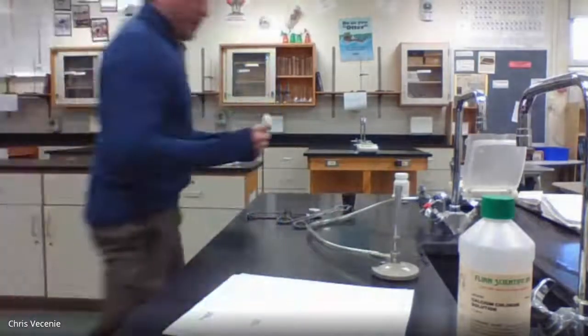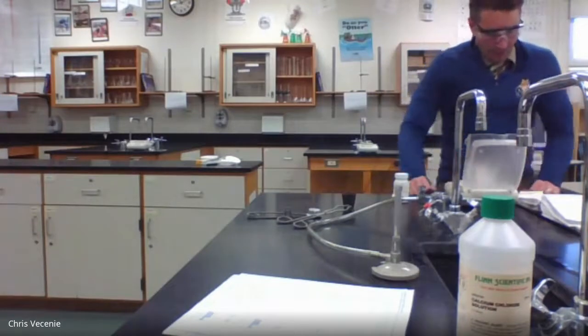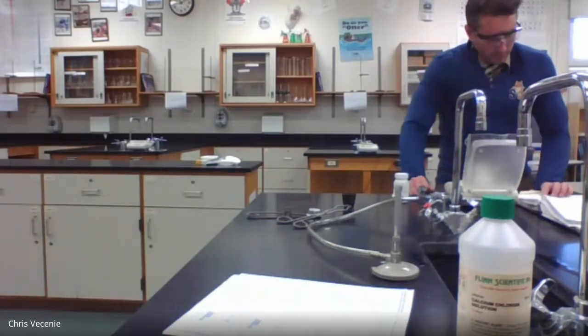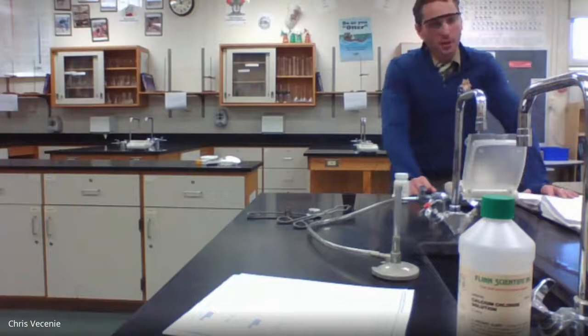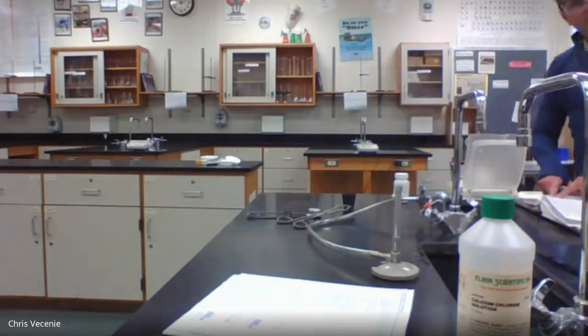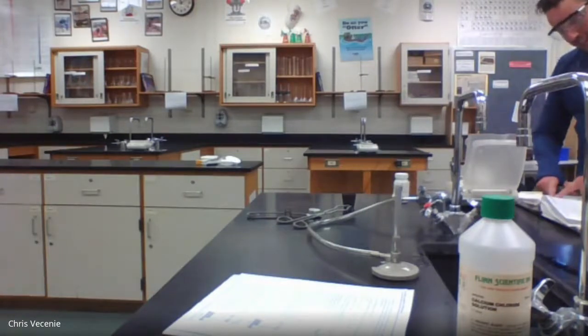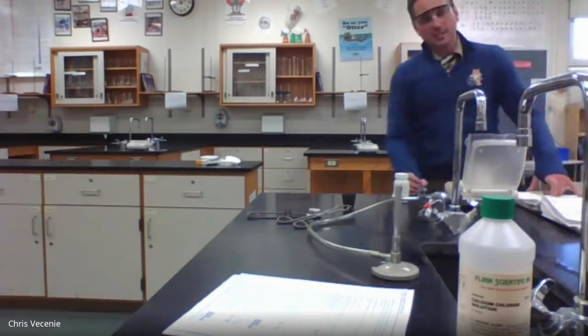So I'm going to take it over to my balance, zero out my balance, put my paper on there. All right, and my filter paper by itself weighs 0.60 grams. So if you look in your data table, 1, 2, 3, 4, 5, 6 up from the bottom, you want that to say 0.60 grams.